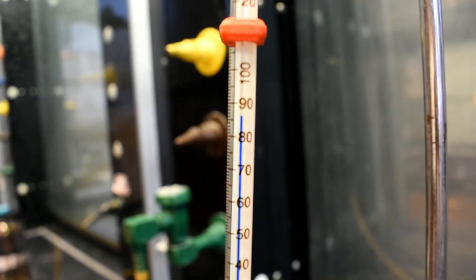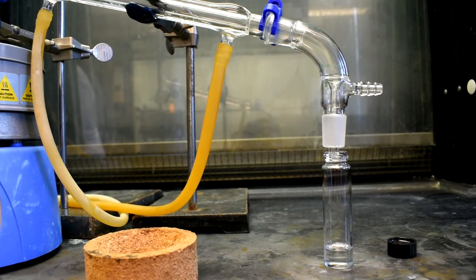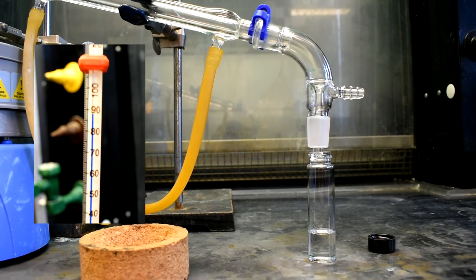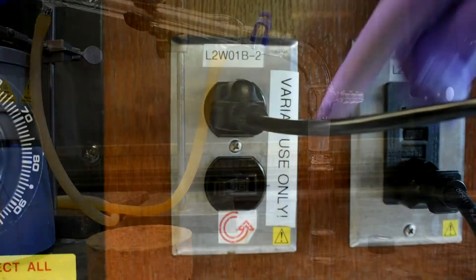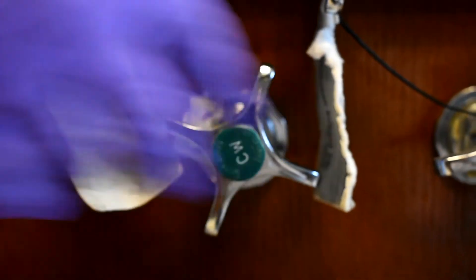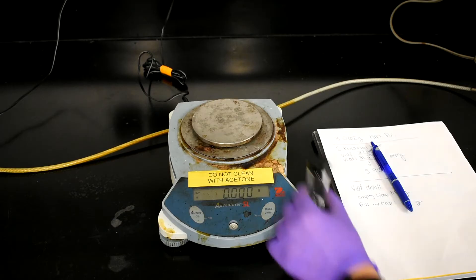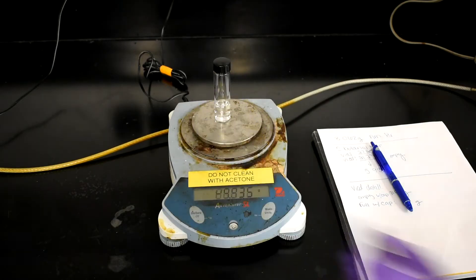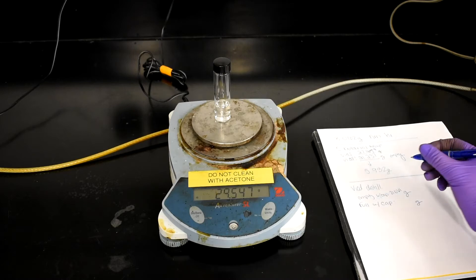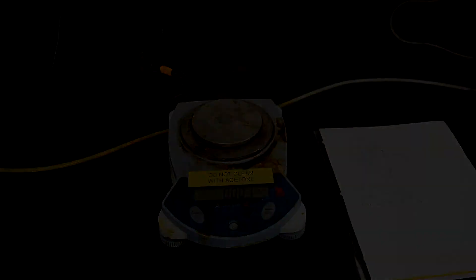Take note of the temperature at which the distillation begins, and also the temperature at which distillation ends. This will be your boiling point range. Turn off the Variac and turn off the water. In front of your TA, weigh the collected vial. Zero out the scale and be sure the vial is the same as before, meaning with or without the cap. Write down the weight of the vial and have your TA sign this value. Save your vial in your drawer until next class.